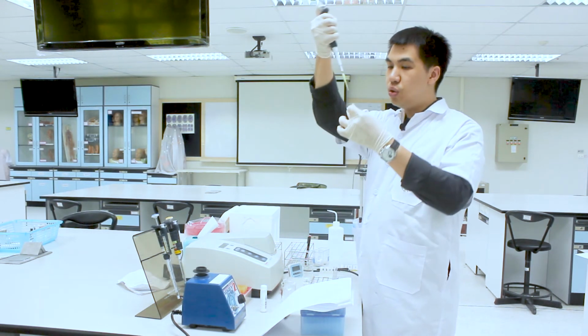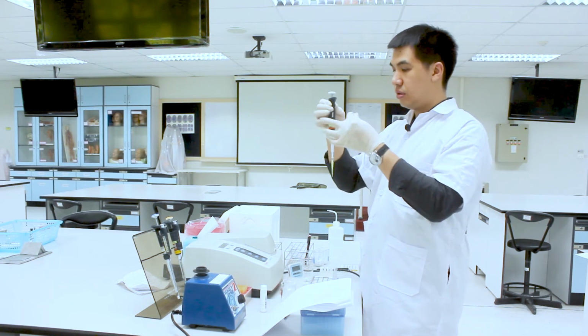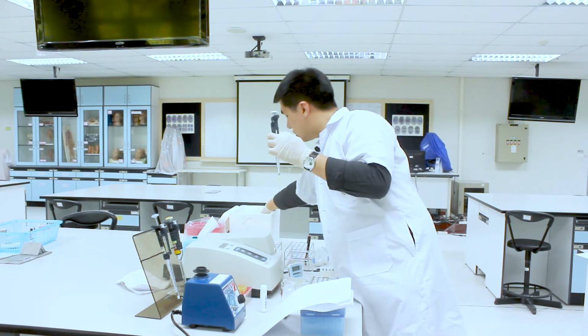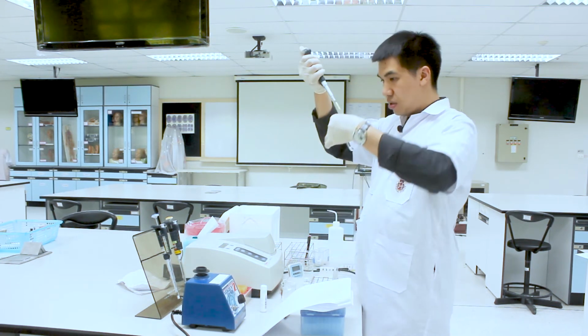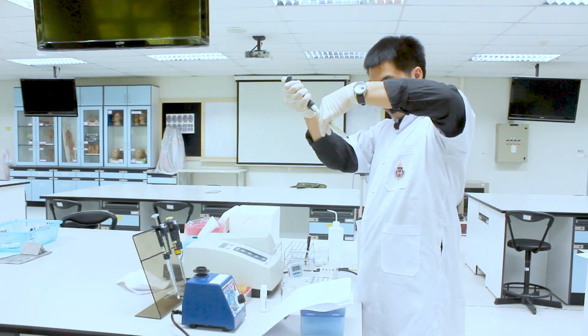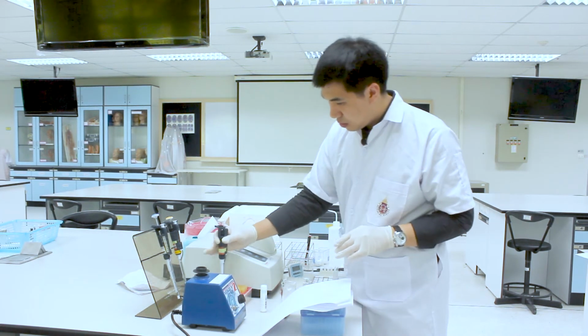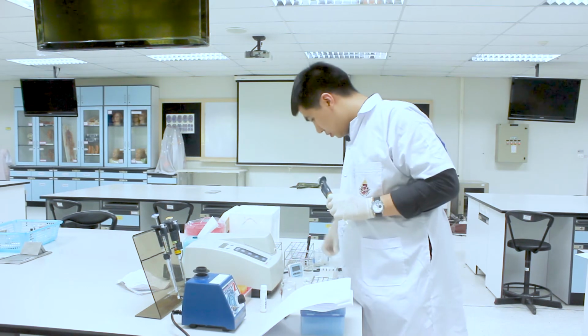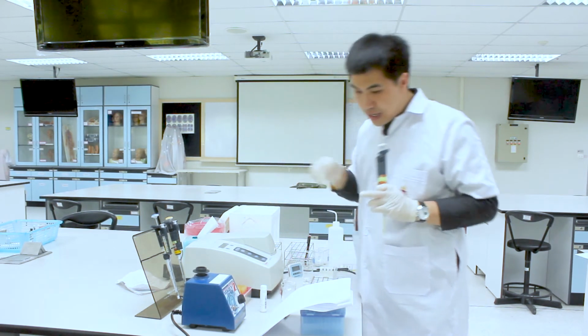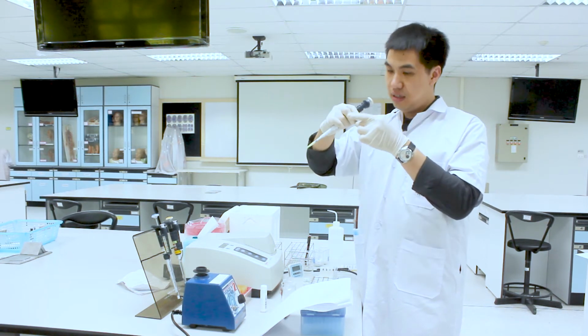And the unknown 2 for the fifth tube. And the last tube is for the cholesterol calibrator, whose exact concentration you already know.